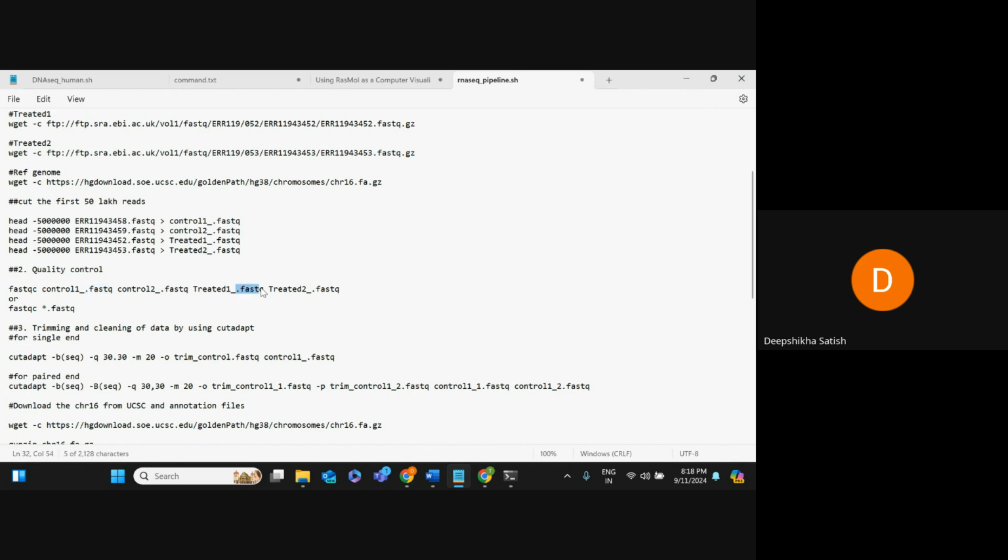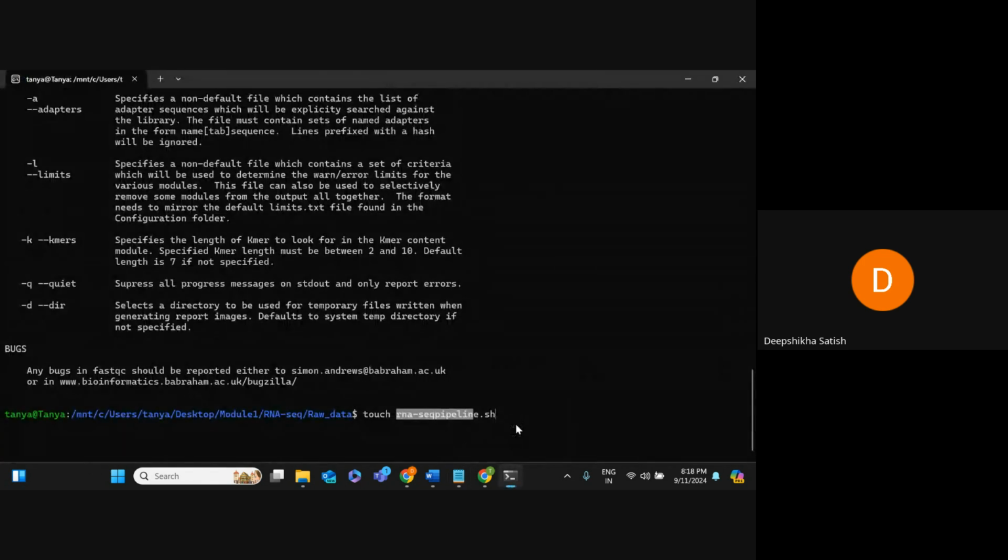It is common in all the files. So in module 1 in the Linux commands, you might have heard about the star, right? So star is indicating what? The all, right? So you just have to write on the terminal fastqc, give a space, star dot fastq. Why dot fastq? Because it is common in all the files. Then just copy that and run it on the terminal.